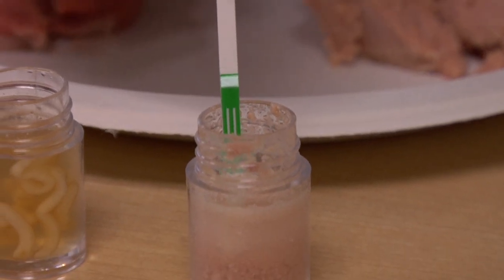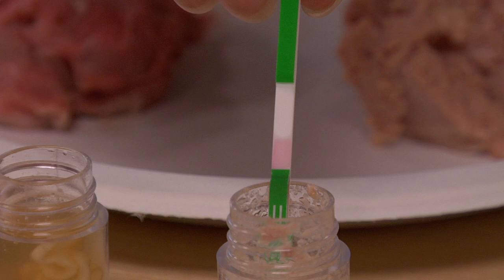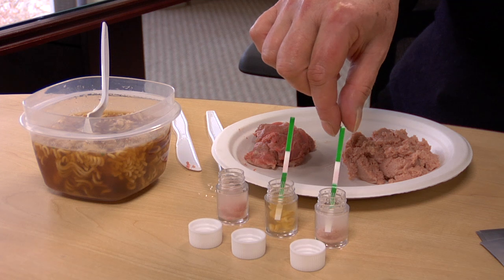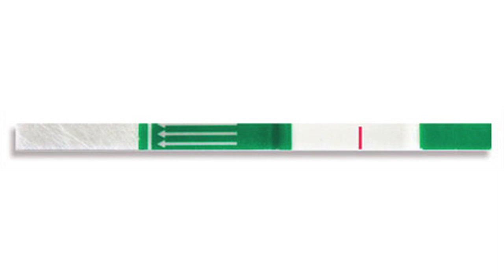The test strip is immersed in the solution to the first white line, the one under the arrows, and held there briefly until the solution has migrated approximately halfway through the white center of the strip. The test strip is removed from the solution and placed horizontally and allowed to develop for 15 minutes. Here we see the line for the control, indicating the strip is operating properly.